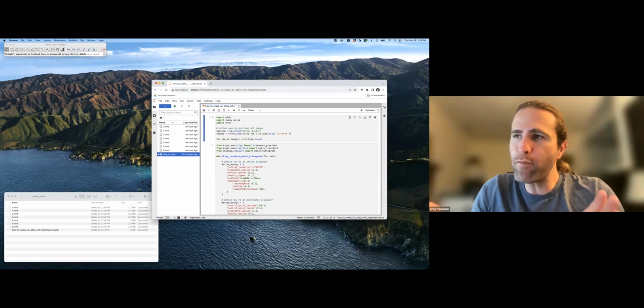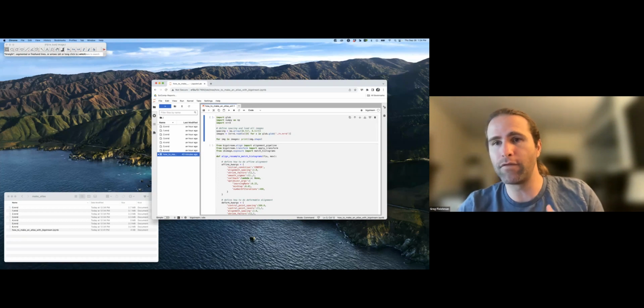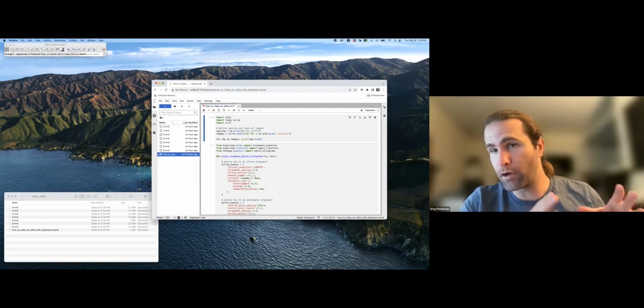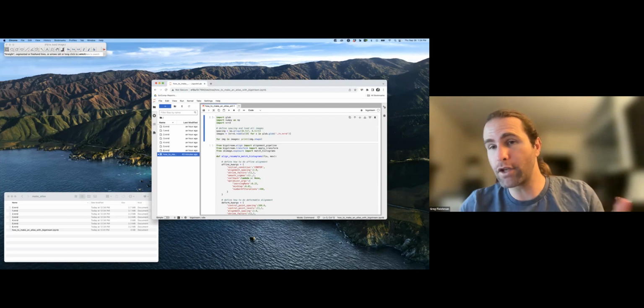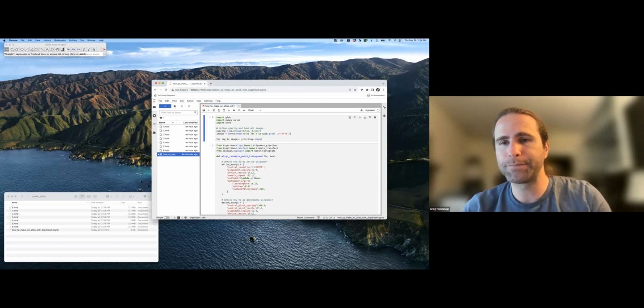But remember, the output in this particular case is a new image, something which is an average representation of the shape and brightness characteristics of your population. You're not actually changing anything from your original raw data. And it's actually a good thing, this sort of stretching of intensities across the full bit type and interpolating between values, in the atlas image, because that might actually be more of an average representation of what you would collect on the microscope over multiple samples.